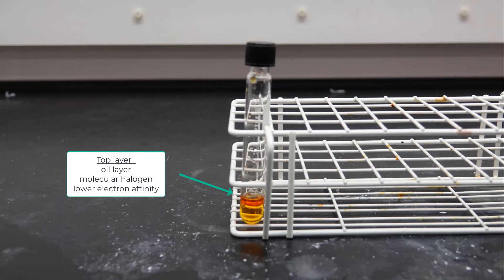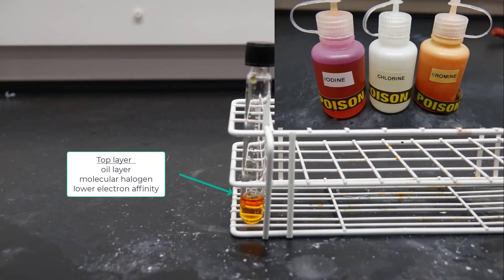The oil layer will be on top and that is where you should see the color of one of the molecular halogens. So if the top layer is pinkish purple then iodine is in the oil layer. If there's no color in the top layer then chlorine must be there, and if you see orange then bromine is in the top layer.